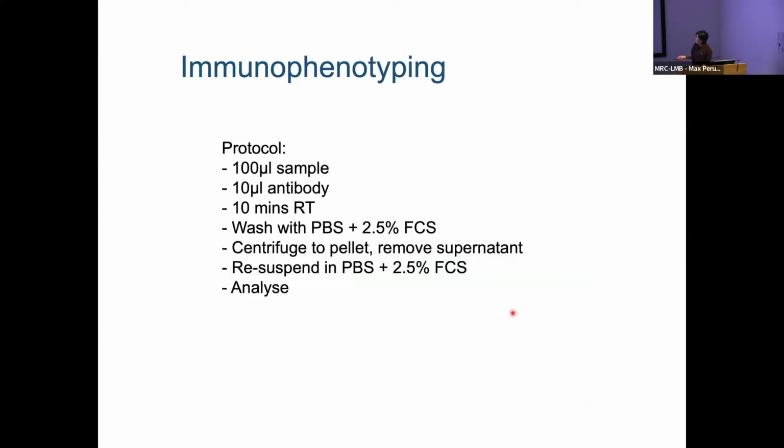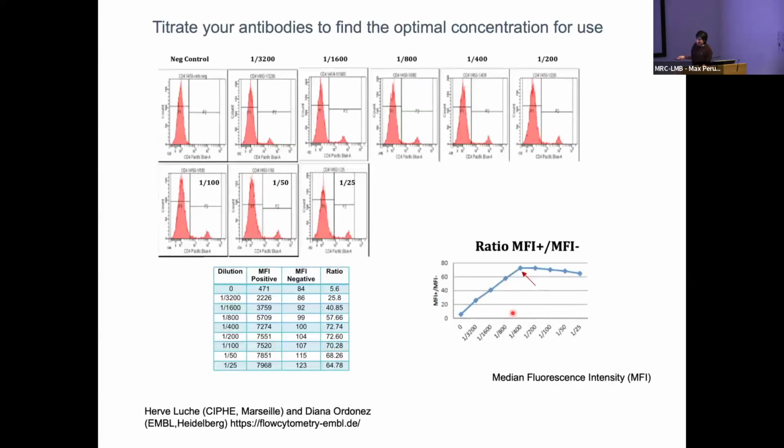So the best friend of flow cytometry is immunophenotyping, of course. So these are the simple staining protocols. Again, I have to emphasize the importance of titrating your antibodies. You will want to use appropriate concentrations, ideally just the concentration entering the plateau. In this way, you achieve the best resolution with a reasonable amount of the antibodies. The antibodies are quite expensive.